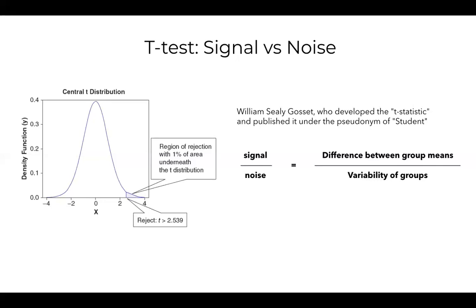So to select features that fulfill the criteria, we use a p-value. You might have heard about this p-value. The p-value is something that is based on the distribution of all values in our sample. So how do we calculate the p-value? The distribution helps select the observations that show differences between two groups with low probability of an error. We calculate all this using the t-test formula, which I will be discussing next, but I think we have a chat.